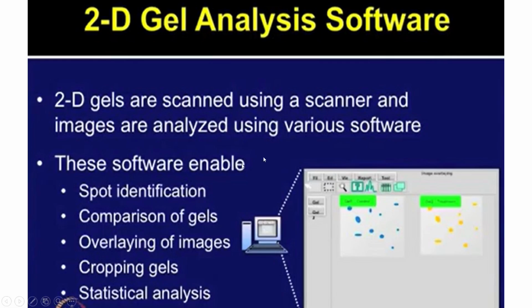So, sir talked about the software as well, how exactly your proteins can be analyzed using this specific software.